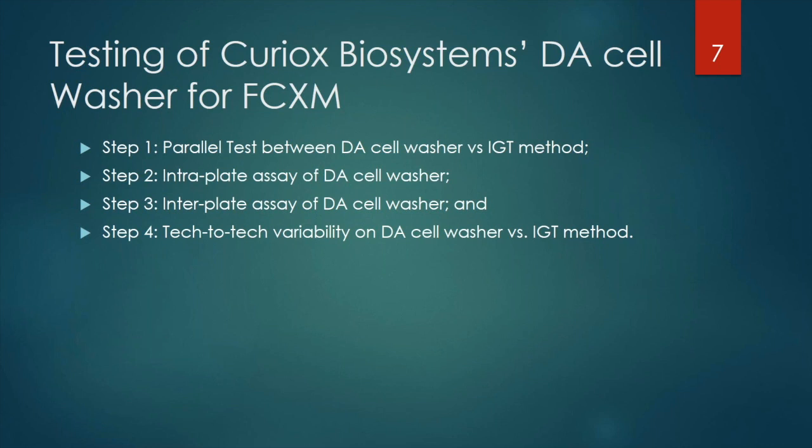And when I do an interplate assay, I run the sample in 2 DSL plates, and I see the consistency between plate to plate. So that is my interplate assay testing that I had performed. And finally, which is very critical, is the tech-to-tech variability testing. I do not have sufficient time to present all the data here, but I will show you a couple of interesting tests that would also be interesting to you, I hope.